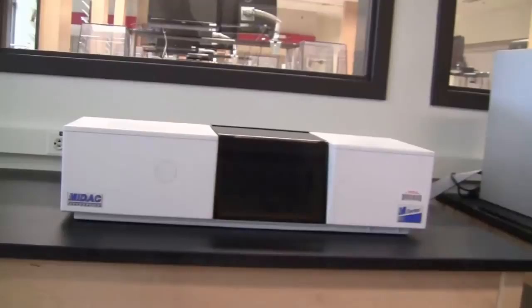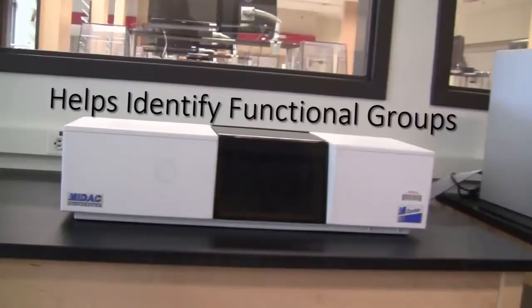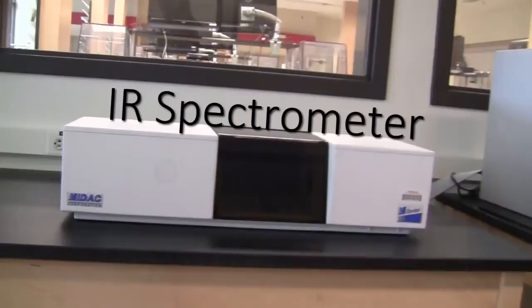Today we'll be performing infrared spectroscopy, also known as IR. IR is used to assist in identifying functional groups in organic molecules. This is an IR spectrometer. The instruments that we use are made by MIDAC, and the software we use is called Essential FTIR.